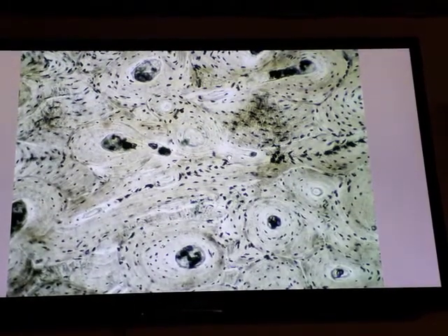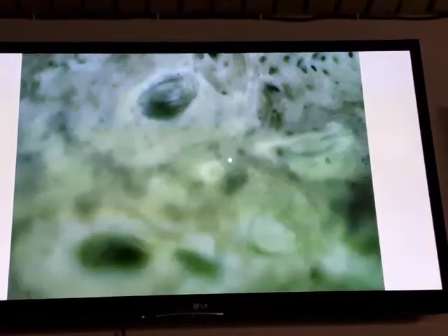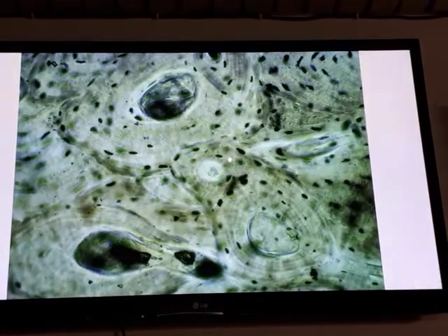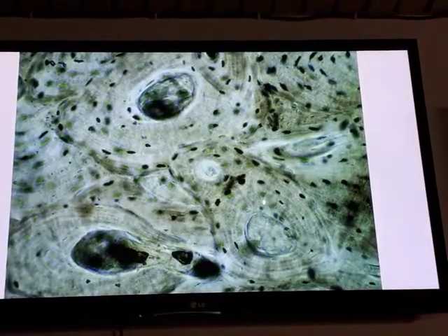Because the matrix of the bone is calcified, metabolites are difficult to diffuse through it. So the spaces within the matrix appear as fine cylindrical spaces. These spaces are called canaliculi.